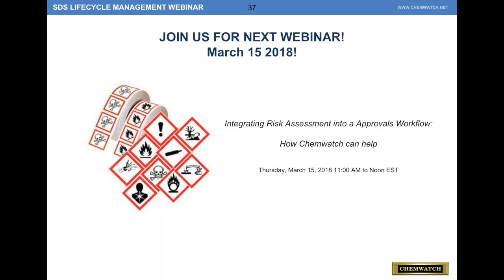Our chemical risk assessment module is the best in the business. Our approvals module is really good. It's flexible, it's user configurable. It can have multiple workflows depending on the toxicity of the chemical or the hazard. You can run a risk assessment, and based on the controls you introduce, it will change the hazard rating of the chemical, and that can be fed into the risk assessment. It's a really powerful tool, so be sure to join us for that.